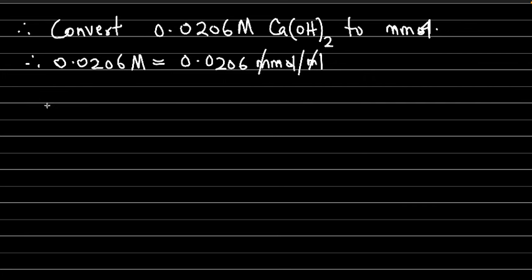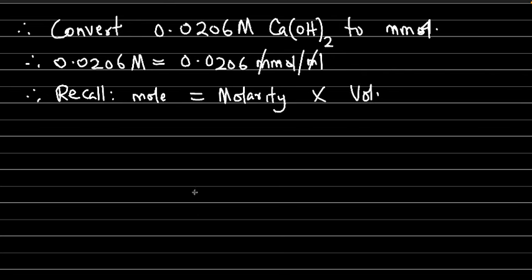All right. Now, for us to solve for the mole of this, recall as well that mole equals molarity times volume. Molarity of this base is CB, which is 0.0206. The volume of this base, the one we made use of, was 25 mil.